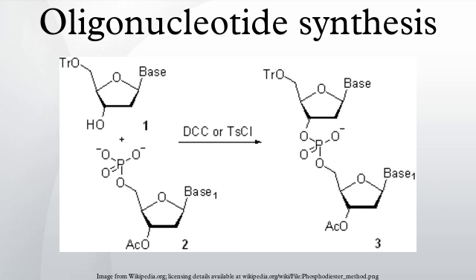Special solid supports are used for the attachment of desired functional or reporter groups at the 3'-terminus of synthetic oligonucleotides. For example, the commercial solid support 4 allows the preparation of oligonucleotides bearing a 3'-terminal 3-aminopropyl linker. Similarly to non-nucleoside phosphoramidites, many other special solid supports designed for the attachment of reactive functional groups, non-radioactive reporter groups, and terminal modifiers and suited for various applications are commercially available. More detailed information on various solid supports for oligonucleotide synthesis can be found in a recent review.